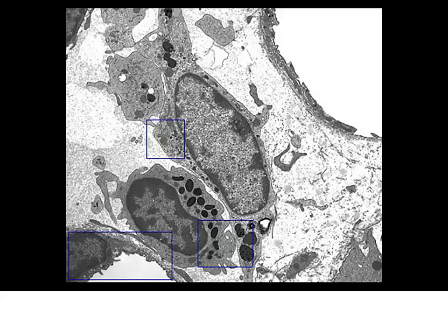Okay, we're looking at different cell types here. Now what we're going to be looking at in our connective tissue, we're getting into the more specialized cells, our leukocytes. We can see very specific granules in these. And this cell is going to be larger than what we'd seen before. We're not seeing indented nuclei, but we're seeing these vesicular structures inside, dark in nature, some of them, and some are going to be lighter in color. At the light microscopic level, these are going to appear as soap bubble-ish.